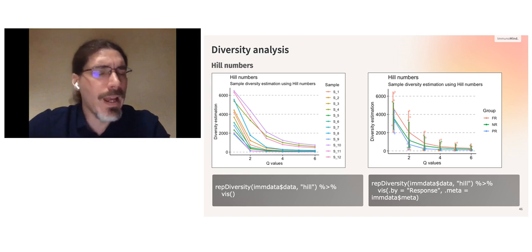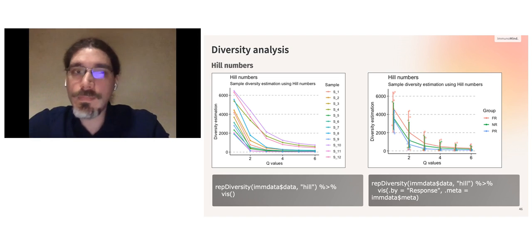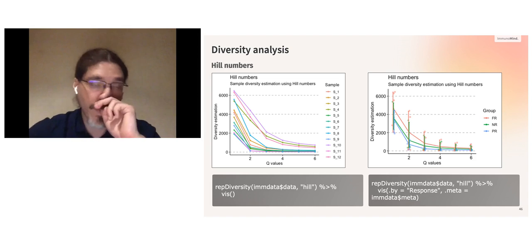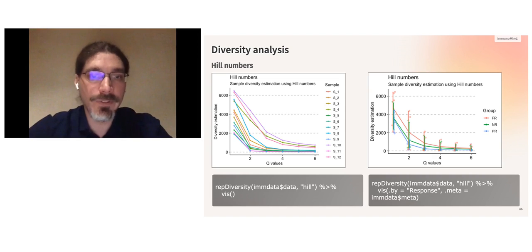I didn't encounter this method in the immunotherapy publications, but I think it's interesting, specifically because of giving this structure of the repertoire, in other words, additional information about repertoires rather than just the estimation of the true number of clonotypes.